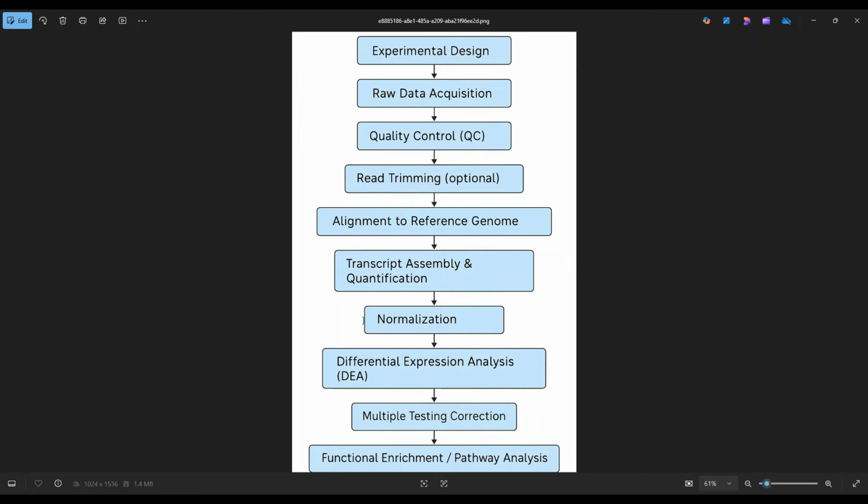And then you do a lot of other things, like when the FastQ file is converted into the BAM file, and the BAM file is the binary alignment. From SAM, you convert it into BAM, and that is done after you align it with the reference genome.